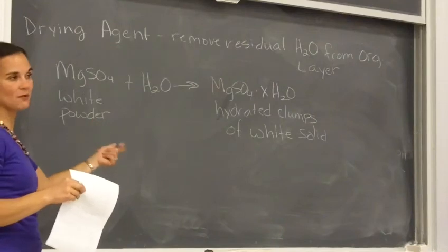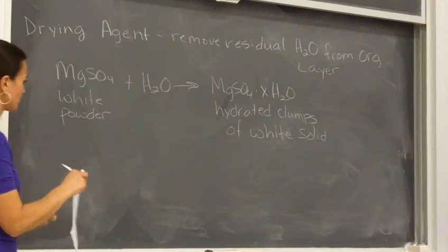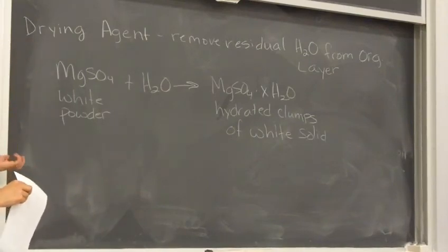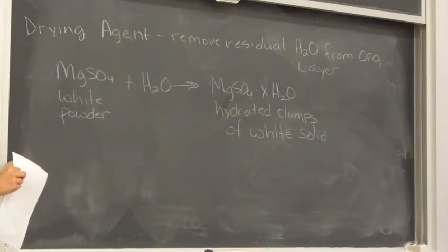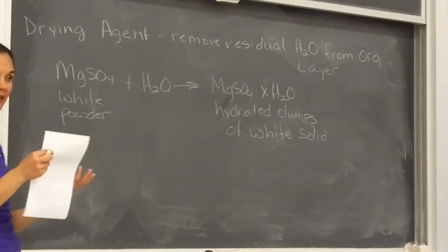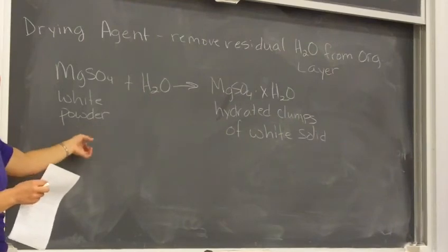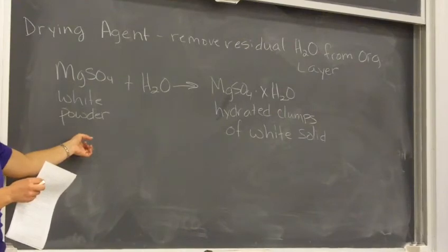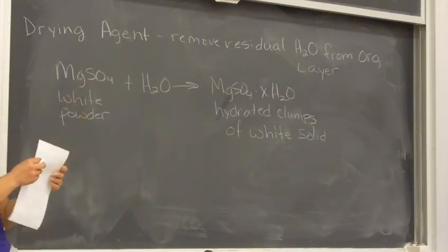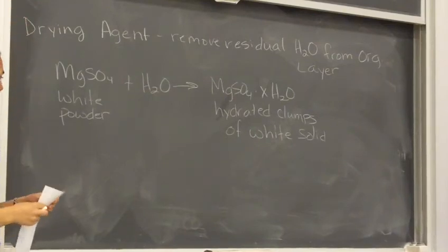And then that magnesium sulfate and that filter paper is going to go in the waste container that's in the reagent hood. Okay? One thing you don't want to do with magnesium sulfate, and I know your lab manual tells you to use about 2 grams or so of this, it's trying to just give you a ballpark number so you have an idea of how much you need. You're going to add it based on what I told you. Have enough in there that you've got clumping with a little bit of it free floating, and when it's free floating, it's going to kind of look like a snow globe. So when you swirl it around, you'll have the free floating looking like a snow globe.